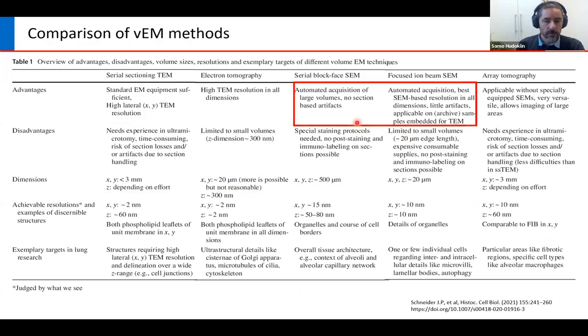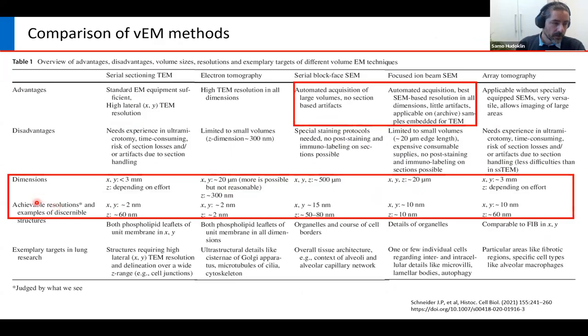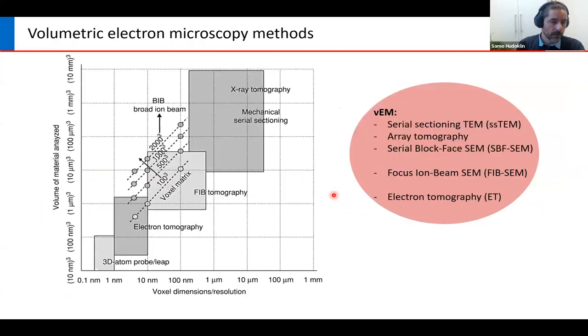Most of them can now be automated to a certain degree, but the major thing to keep an eye on is the dimensions that you can reconstruct with each of those techniques, which also takes some time. So maybe this slide will show you that in a nicer perspective.